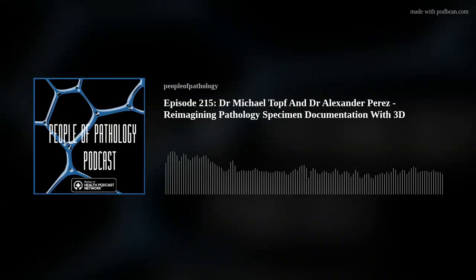Today, we're diving into the intersection of technology, surgery, and pathology with Dr. Michael Topf and Dr. Alexander Perez. Their team is pioneering the use of affordable 3D scanning and mapping technology to create detailed digital models. All right, let's get into this innovative technique with Dr. Alexander Perez and Dr. Michael Topf.